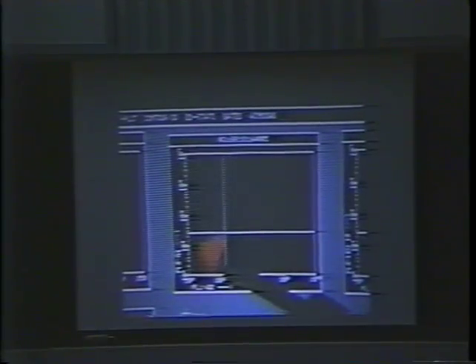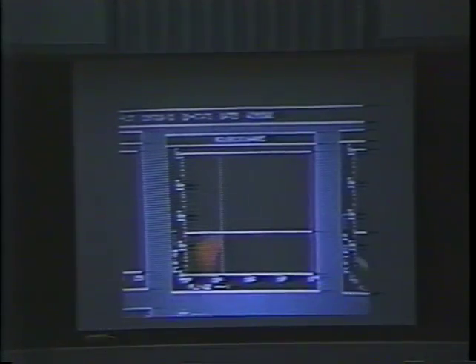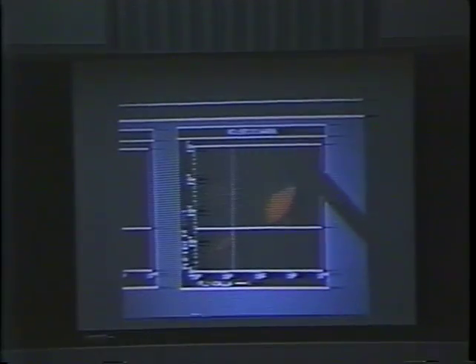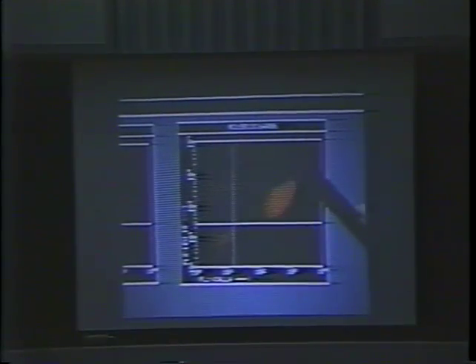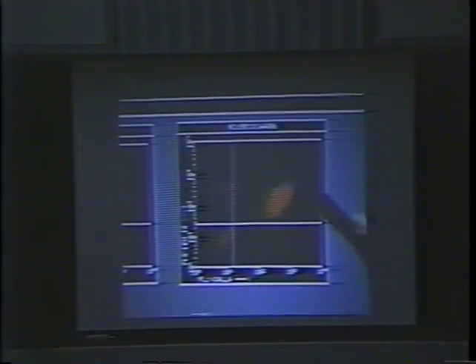This is an example of a childhood leukemia. In this first panel, we can see that there is very little nonspecific staining. Here is where the unique population of leukemic cells becomes apparent. This particular position of cell or cell cluster would never be seen in normals. It is a combination of an immaturity antigen with a marker of B cells. So already, just by this unique cluster of cells being present, we know this child has a leukemia.